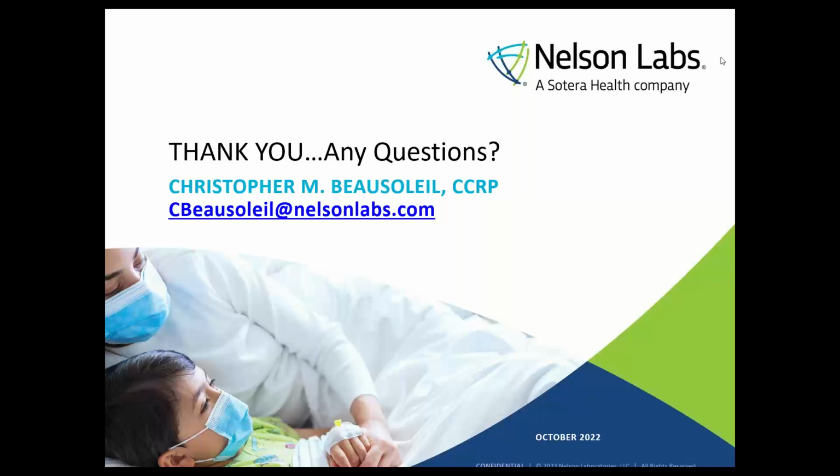If you're just using this for a screening study or screening of multiple products, you can use a smaller sample size. If you're intending to do this for submission, and you have no experience with your product, we recommend you get some data on it, maybe even do a smaller pilot study first and then go into a larger study, just to confirm that a minimum of 100 is what you would need, and you wouldn't need more than that.